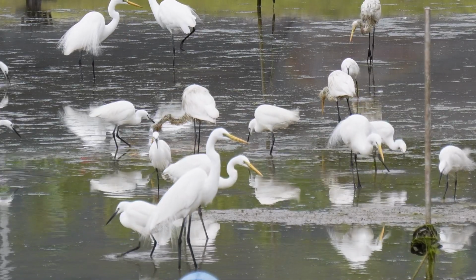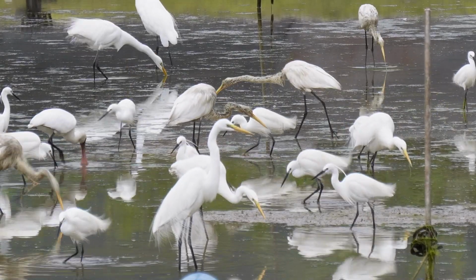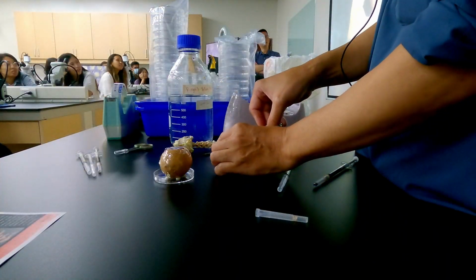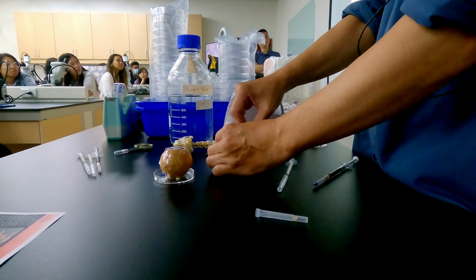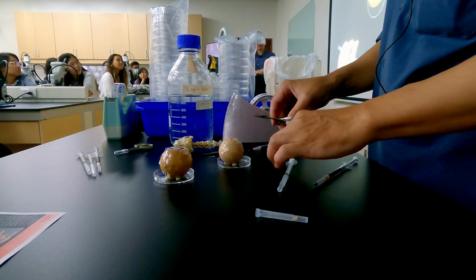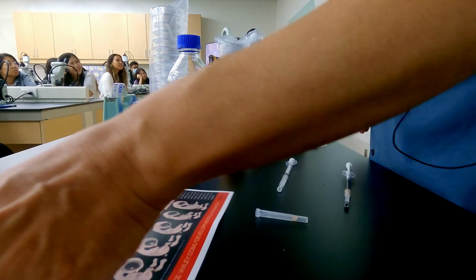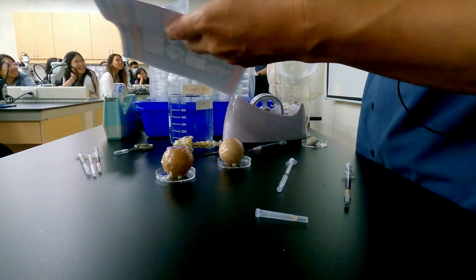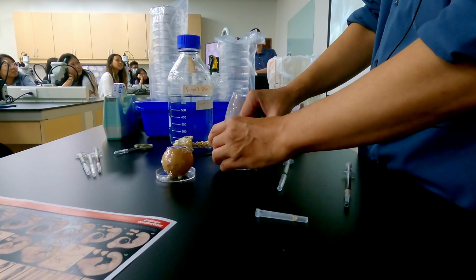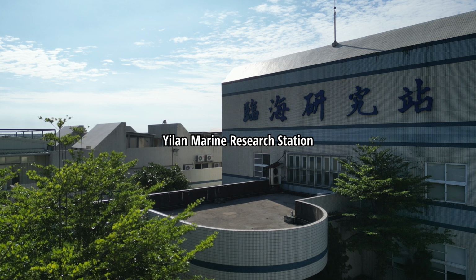Yeah. Seeing those somites form, seeing the limb buds emerge, it gives you a real appreciation for the sheer orchestration involved. You realize that the adult forms we see are just the endpoint of this amazing hidden construction process. And maybe that's the real takeaway here. Engaging with techniques like this, the ones in this protocol, forces you to observe closely, to think about organization and change on a microscopic level. It helps cultivate a genuinely three-dimensional understanding of living things. Moving beyond just the surface appearance. Exactly. It's a reminder that inside every creature, there's this incredible history of development, of precise construction. This deep dive into how we study the chick embryo is really an invitation to appreciate that profound complexity, connecting the detailed work on the bench right back to the amazing natural world surrounding us here in Yilan. Yeah, fostering that deeper appreciation for the complexity hidden within every living thing, layer by intricate layer.